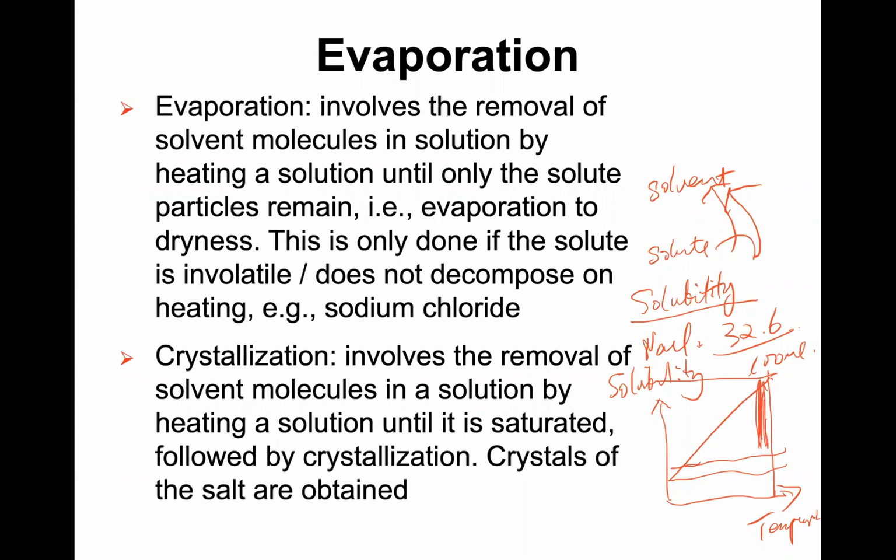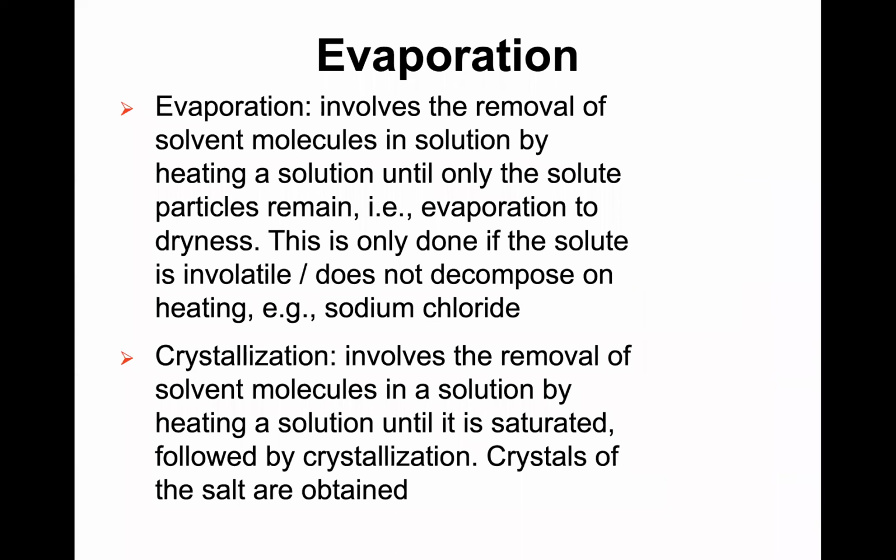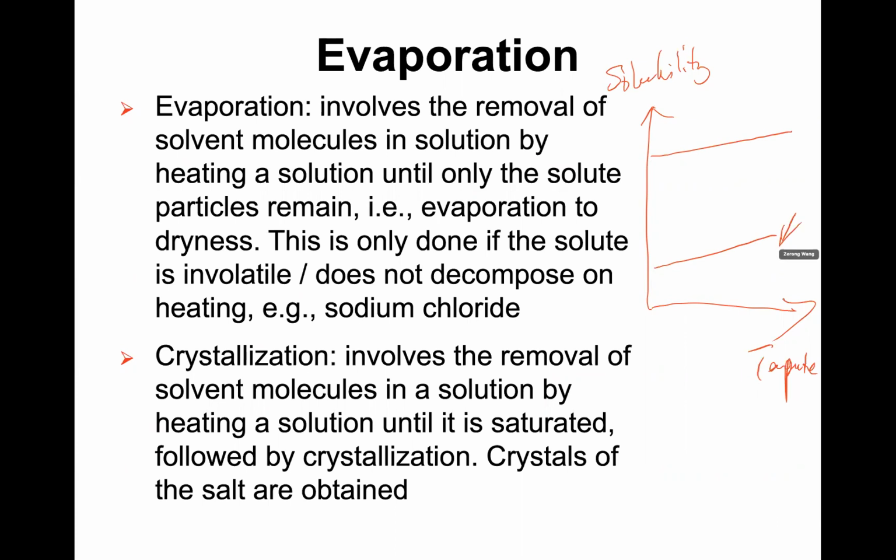But this method doesn't apply to a situation like this. Solubility, temperature. If something has a very slow change, in either case, no matter how high you increase the temperature, solubility only increases slowly. That means when you cool down, you only recover a small amount, so you only form a small amount of crystals. It's not good for getting a large amount of pure crystals. Even if they are very soluble in the solution, when you cool down the difference in solubility is not big, so you still have most of it staying in the solution. You can only get this much out. So either case is not good for crystallization.